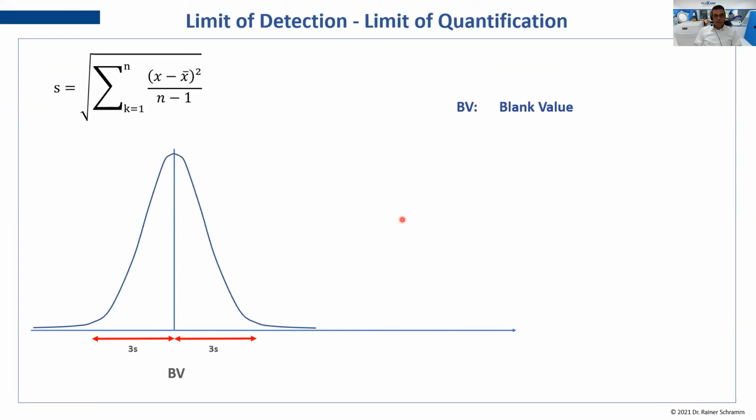You have sand, which is mainly based on silicon oxide. In this sand, you want to get the detection limit of iron. So the best would be to find a pure quartz sand which has no iron. Let us assume there is 0 ppm iron in that quartz. Now you measure this sample 10 times, and you will get this kind of distribution.